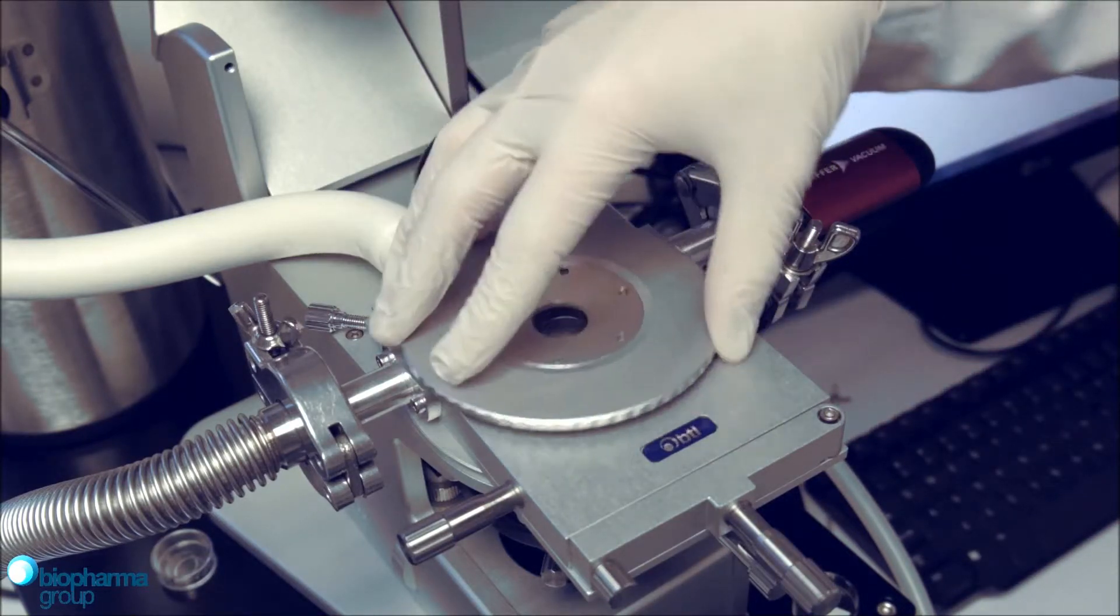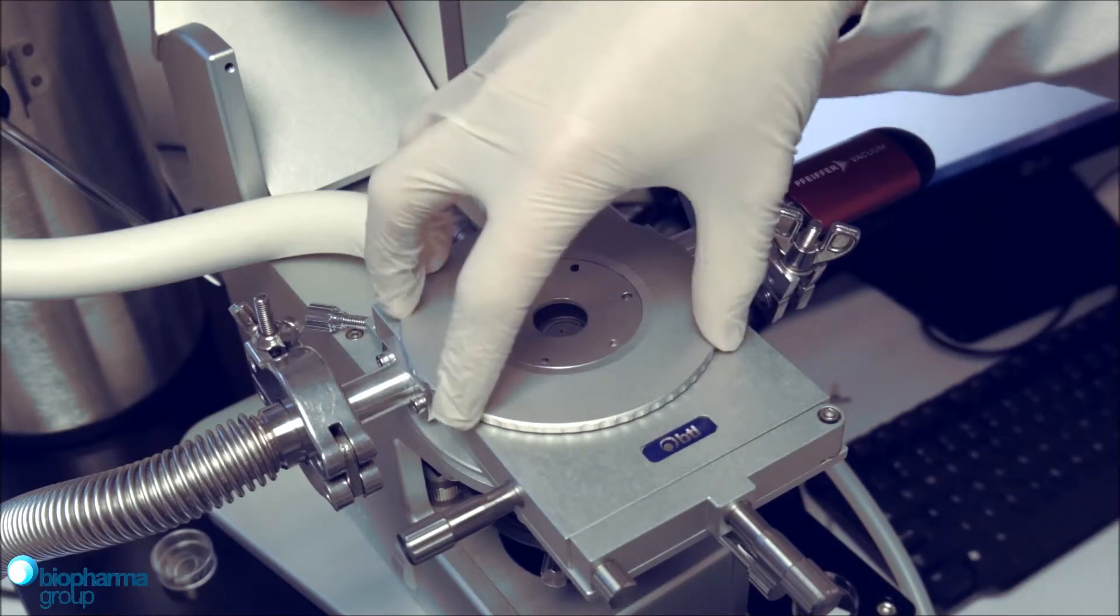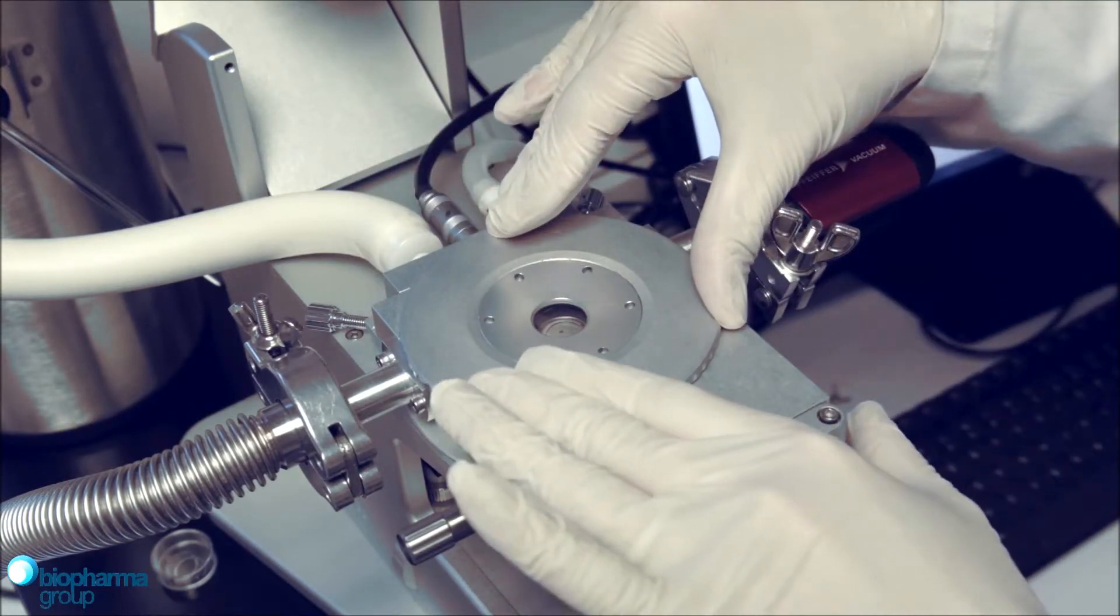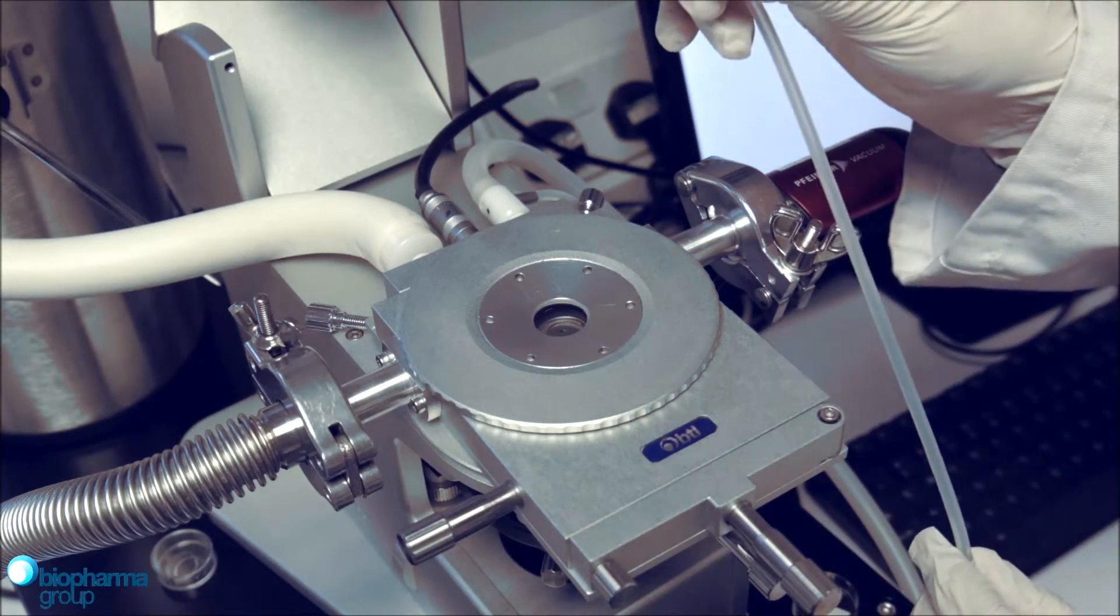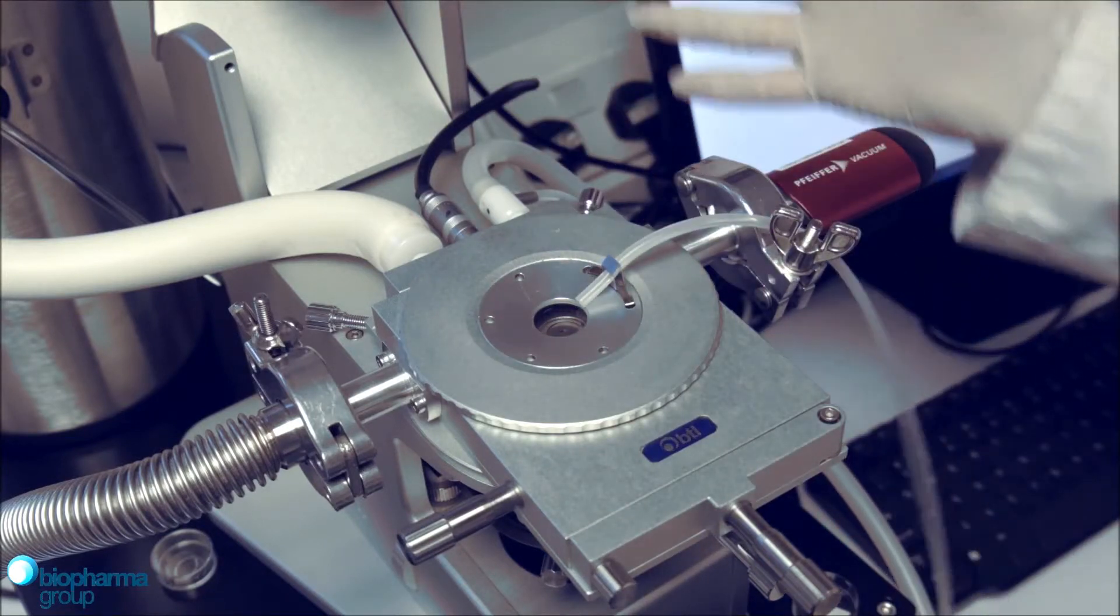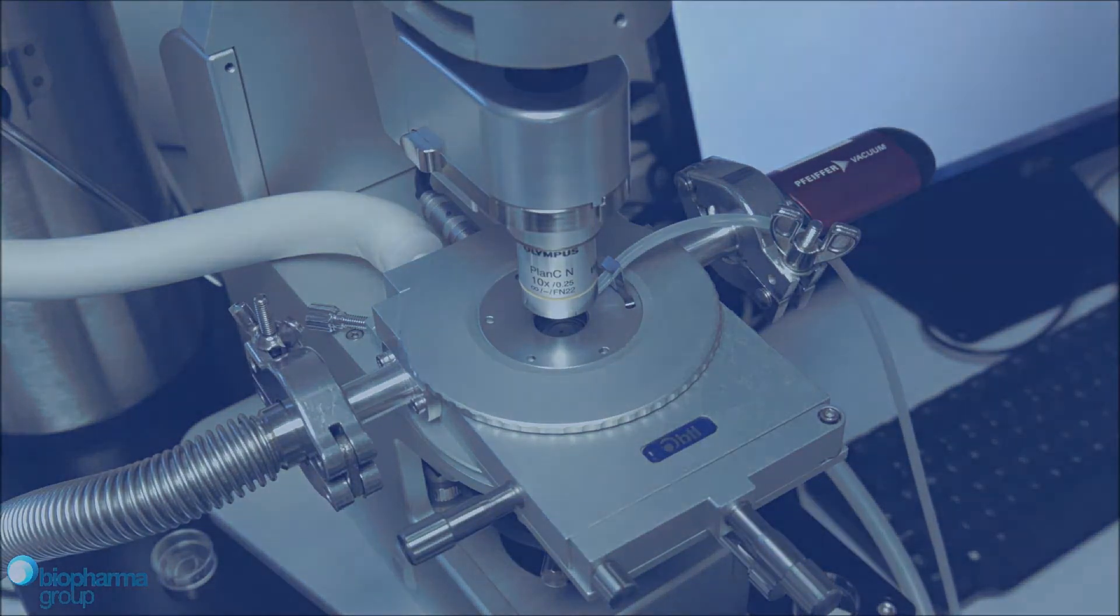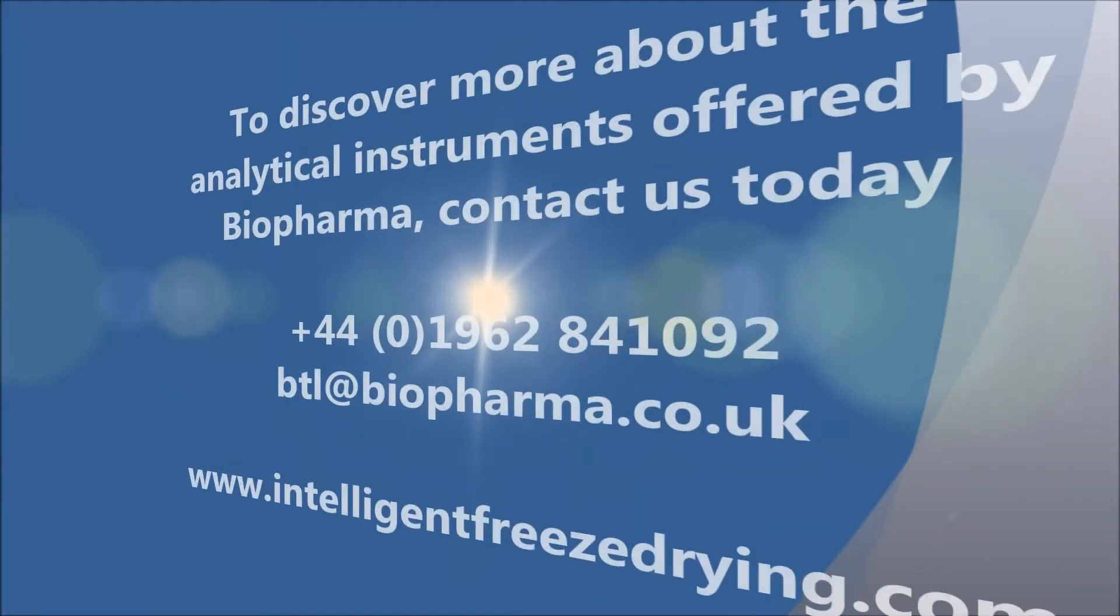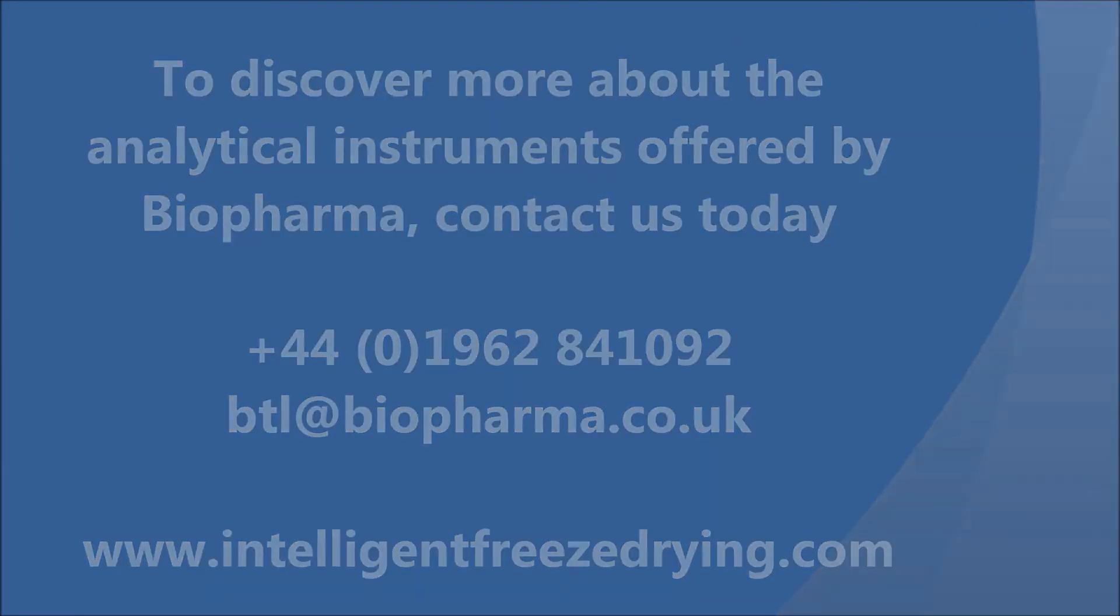Finally, we need to replace the chamber door, screwing only hand tight, then placing the vent from the nitrogen pump into the hole surrounding the window. This prevents the buildup of condensation that may obstruct our view. This completes the loading of the sample, and we are now free to conduct the analysis.